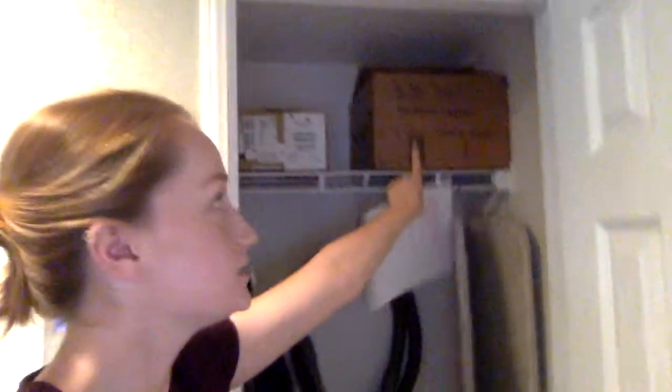I have added a box up here. It says, my screen will kind of zoom, Do not touch incubation location, cultures inside. That's to kind of deter anybody from the closet, although it's not highly active. There's only a vacuum and ironing boards in there. So when I marked this chart, I did say it's secure from children and pets. The door remains closed. I can keep it away from everyone because it is going to be my incubation location. I'll put a sign on the door. That way people stay out. But it is up on a shelf, and I don't see there being any issues.